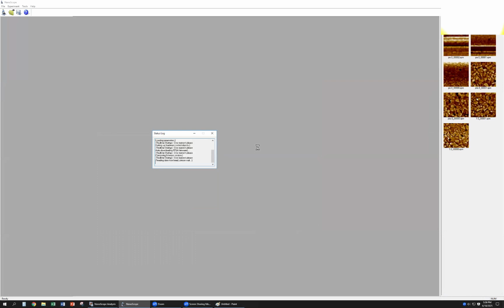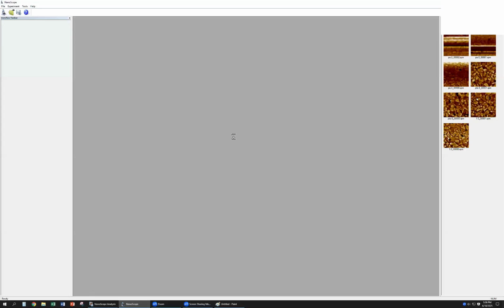So when you load this experiment, then the first step. What's the question? Because my sample is softer than PDMS here. Then you can choose a softer probe, but the calibration may be a little bit difficult, because we don't have a sample of less than a megapascal. The softest one is 2.5 megapascal.